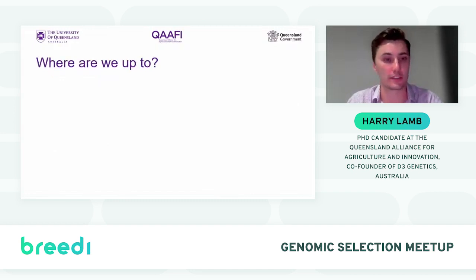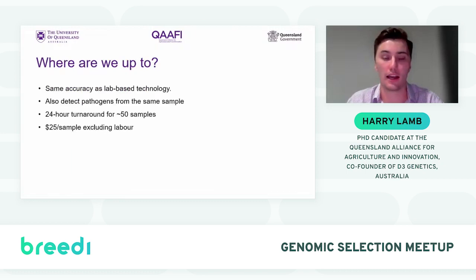So where are we up to? We know the accuracy of the technology, and we know that it's quite accurate. We know that we can also detect pathogens at the same time from the same sample. This means we could potentially detect things like pestivirus while we're genotyping, or other diseases that might be prevalent in a particular region. And we can do all of this in a 24-hour turnaround for about 50 samples. At the moment, this together costs about $25 per sample, excluding labor.